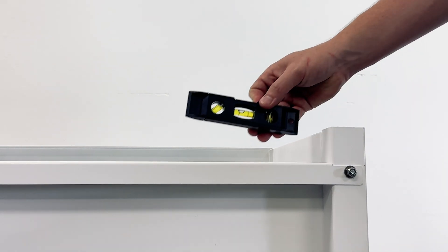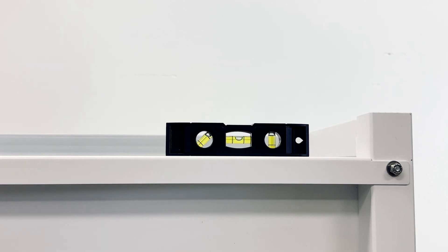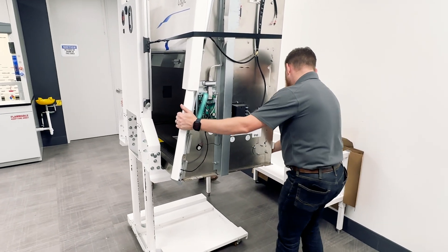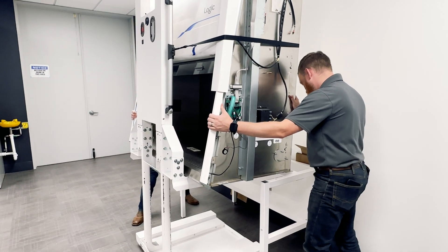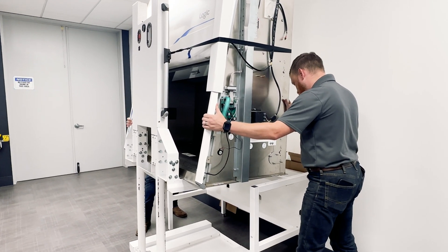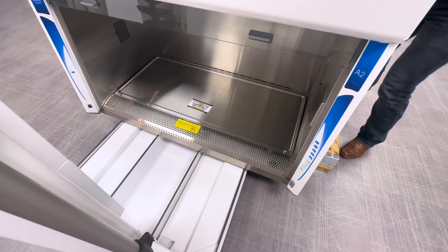Ensure the stand is level before continuing. You are now ready to lift the BSC onto your newly assembled base stand. The next step should be completed by a minimum of two people. Slide the BSC onto a hydraulic table or other lifting device.